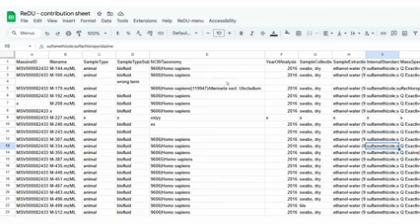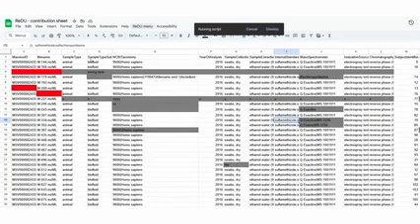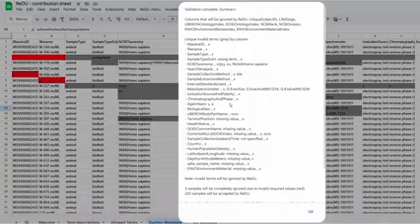There's also a validator implemented in this, which is basically telling you, after you have filled out your sheet, you can use this current sheet validator, and it will then tell you by coloring the different terms whether you did things right or not. So that's some quick check that I typically also do when I fill out the sheets, because it's very easy to make mistakes there.